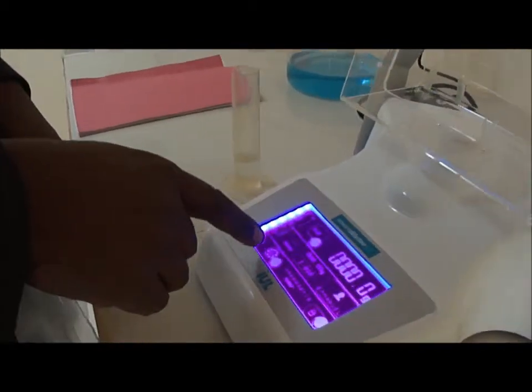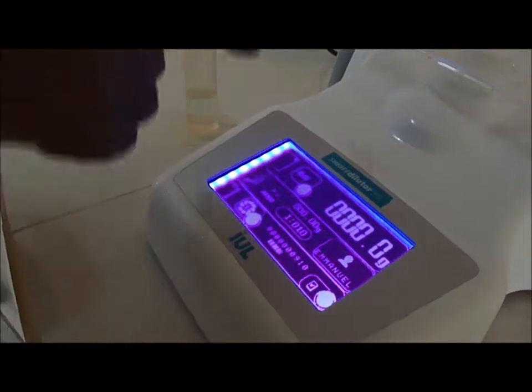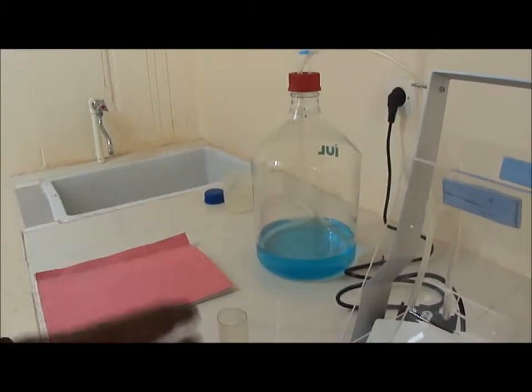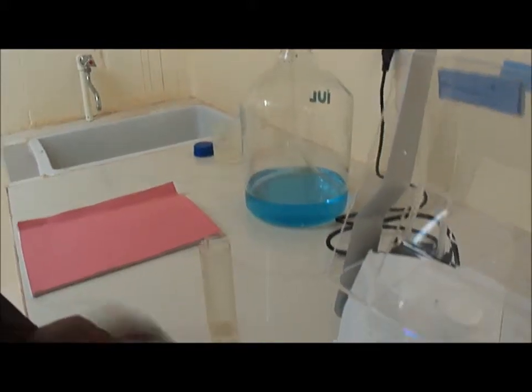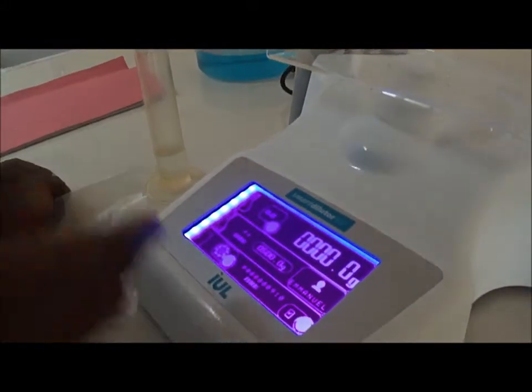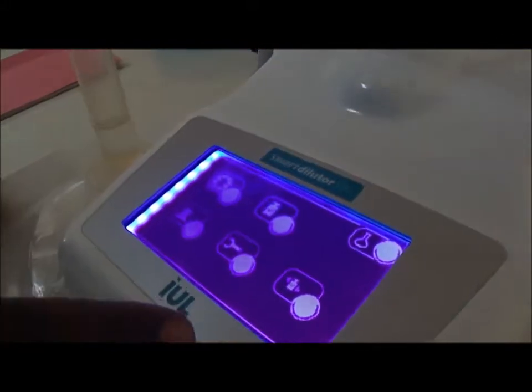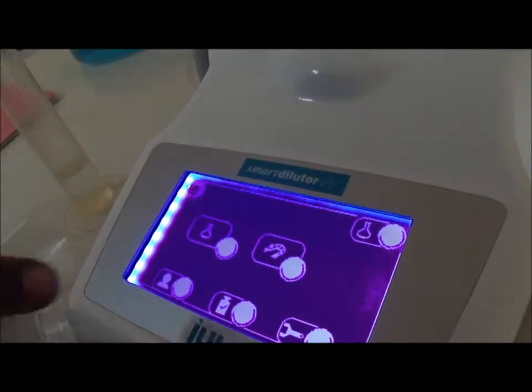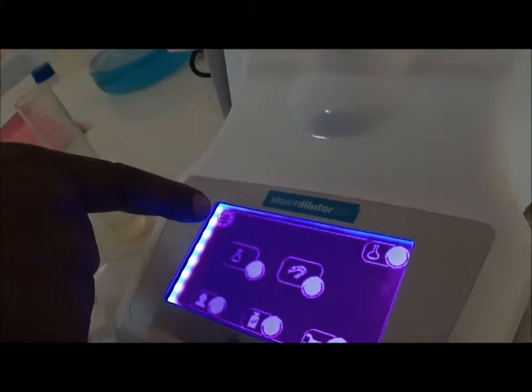I will change the pump because we have set the dispensing program into pump number 2. Then I change it here. But you can easily change this if you go to this menu and the pump. You take it and then you see display here pump number 2.